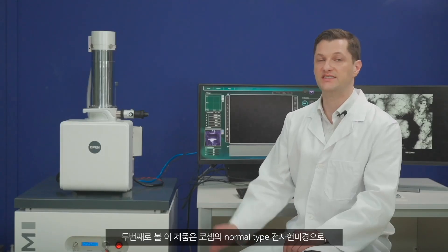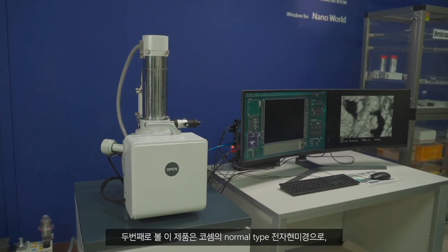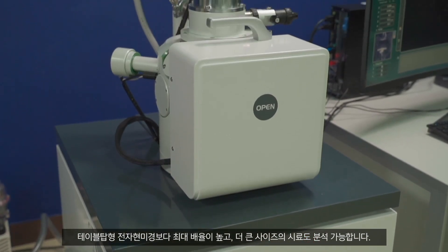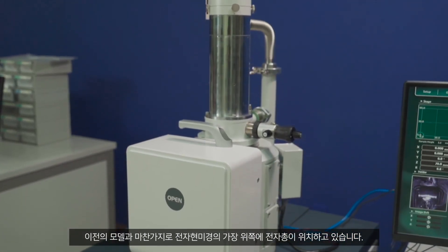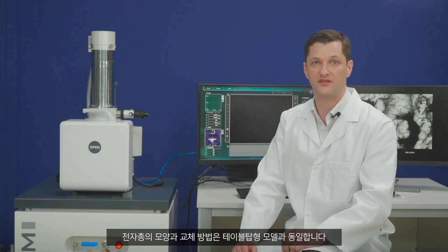The second type of product is the floor-standing type electron microscope of COSEM. It has a greater maximum magnification than the tabletop model and allows analysis of a bigger specimen. As in the tabletop model, the electron gun is located at the top of the electron microscope, and the shape of the electron gun and its replacement method is the same as that of the tabletop model.